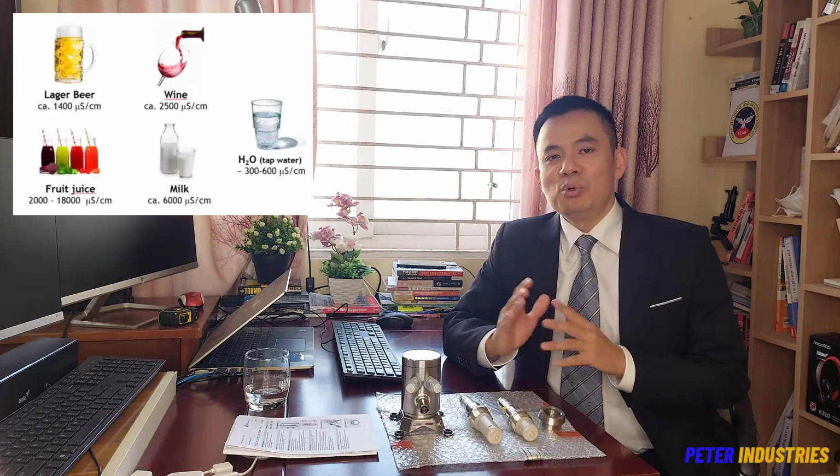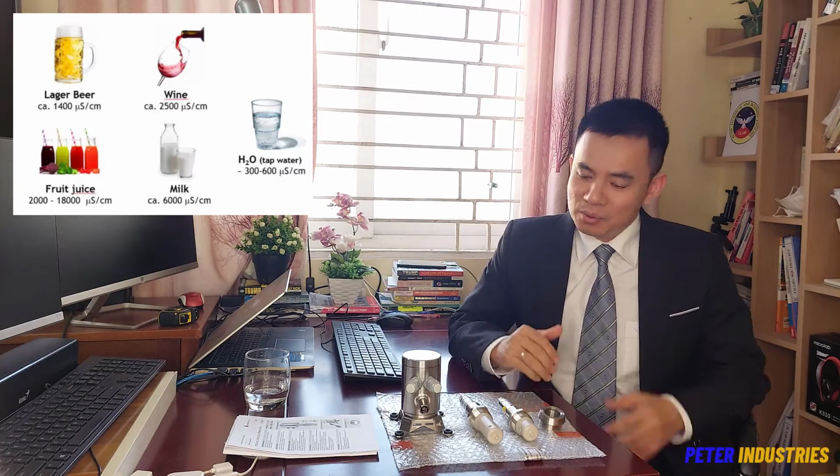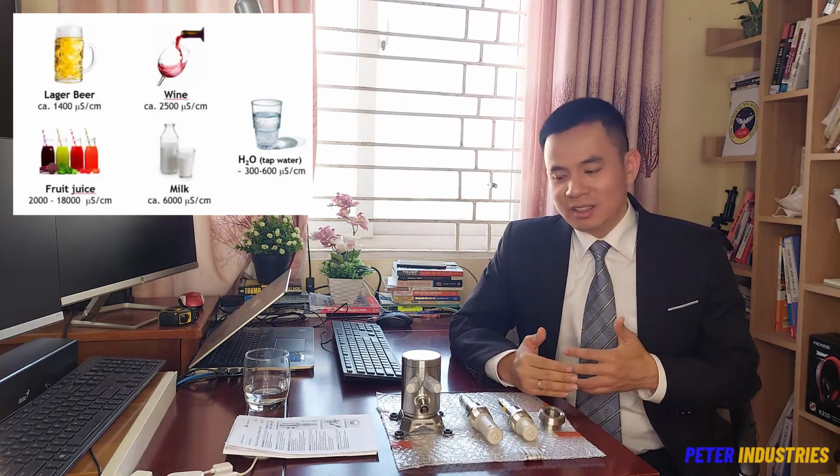And the third application is in the CIP process. It is for CIP separation between the phases, with the acid step, different from the caustic step or the water step. So the conductivity sensor can help us to know which process is running at the moment. And the fourth application is differentiating product and water in food production, so that it is not diluted in the water.